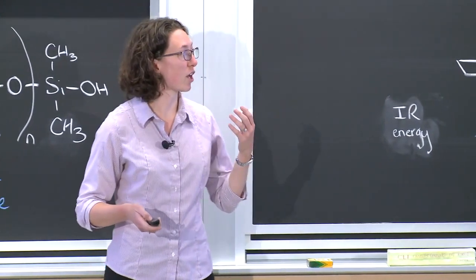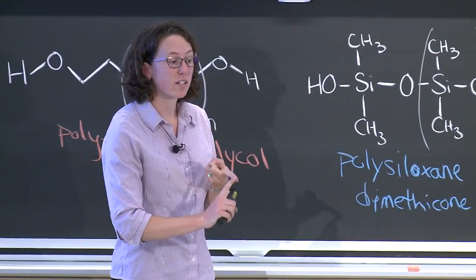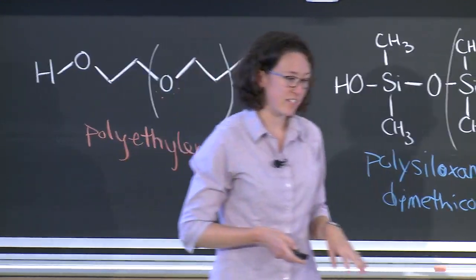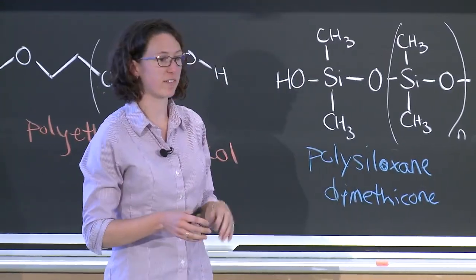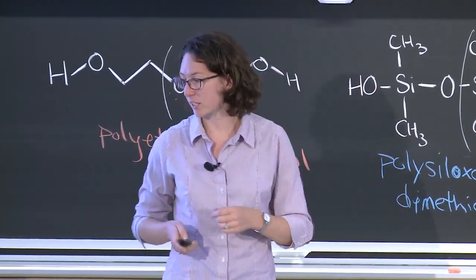So if you're doing a lot of polar compounds with a lot of oxygen groups or nitrogen groups, then you may want to use a more polar compound. You can also get chiral stationary phases that'll help separate enantiomers. If you go on any of the Agilent website or anything, you can get a whole list of different types of stationary phases with different types of polarity. You can substitute these methyl groups out for other things, depending on what application you're trying to use it for.